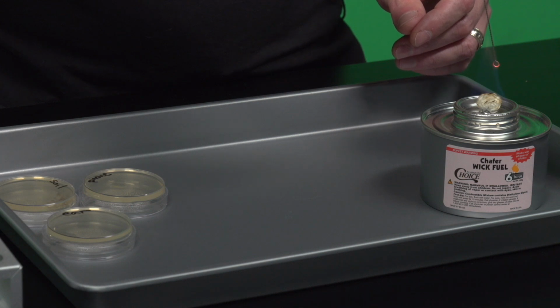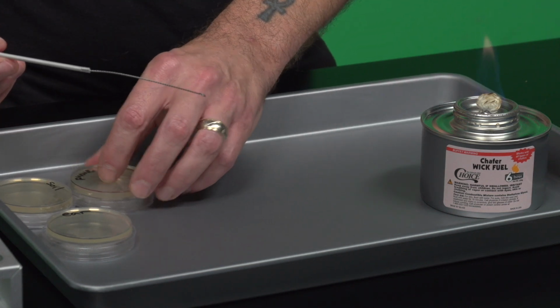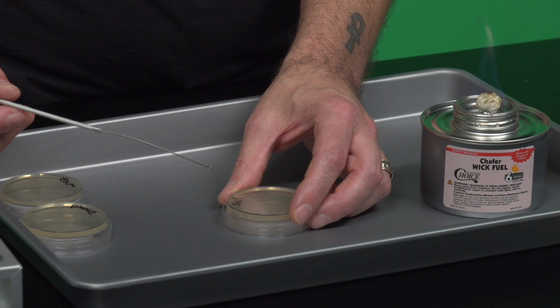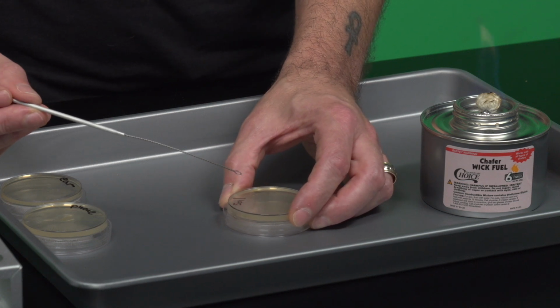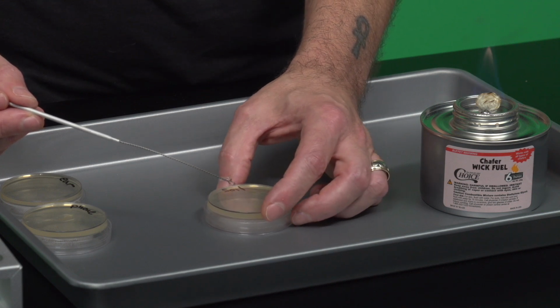Let's go ahead and do these next samples fairly quickly. Remember to always sterilize your loop in between each one. I'm going to do the soil next. And again, wait the time. Don't feel antsy. Don't feel as though you need to get to streaking right away. Wait the time so that the loop cools and you don't kill the microbes that you're trying to grow.